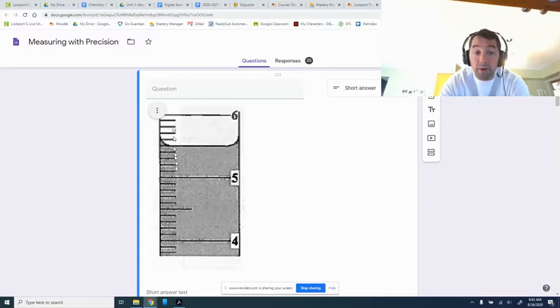And remember, this is marked to the tenths place, so we have to go one place value past that. We have to go to the hundredths place. So this is actually going to be one place value after that 5.5. Since the meniscus is right on that line, that's going to be our estimated digit. So we are going to estimate that as 5.50. If you said 5.51, that would be fine too, since that is, like we said, our estimated digit, and people estimate differently. But that's the place value it should be in, the hundredths place, because this is marked to the tenths place.